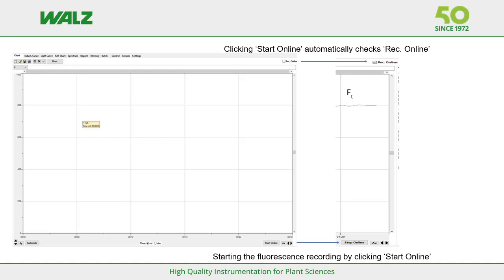The light curve window only gives the parameters, whereas the chart window then records the fluorescence intensities as a function of time. The recording can be stopped by clicking the Now Stop Online button or by unchecking the Record Online box.